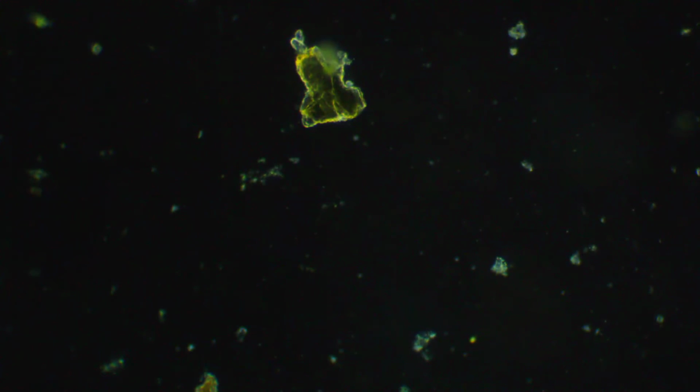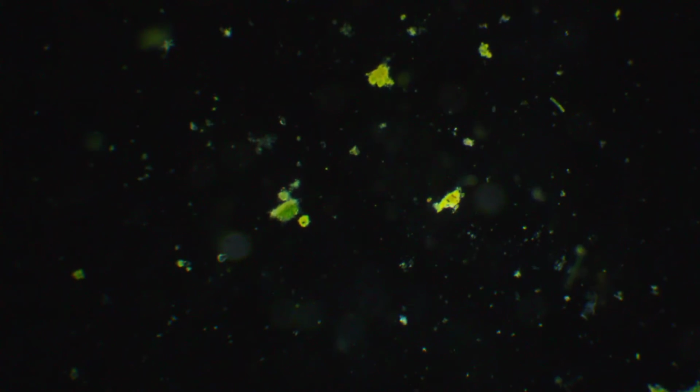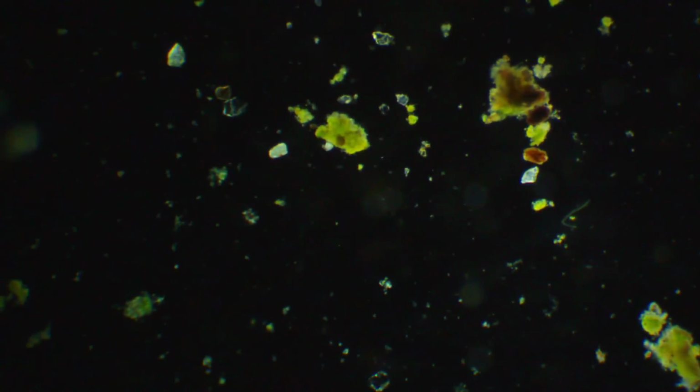Okay, it was a look-alike. It kind of looked like a rotifer sticking out, little flowers sticking off of the moss, because they're stuck to it and they're sitting there with their little heads cleaning the water.